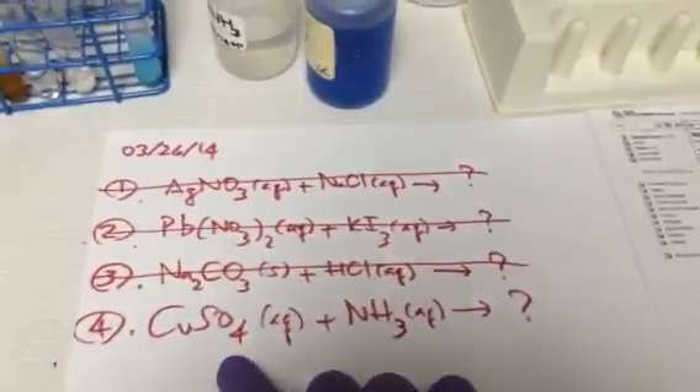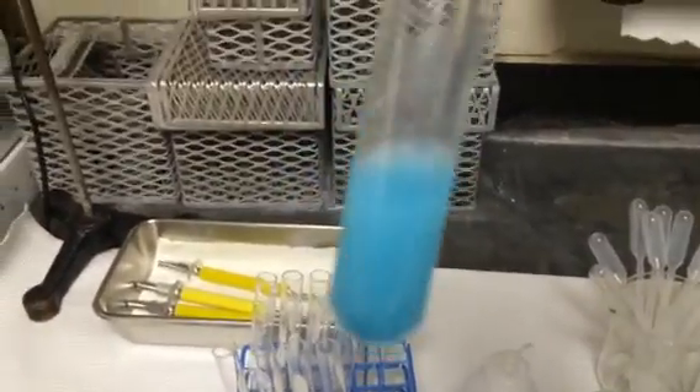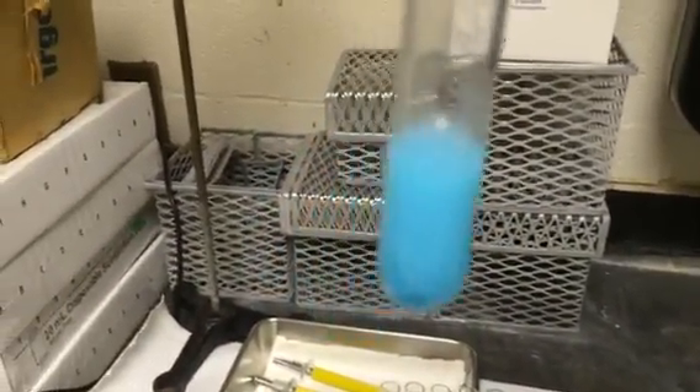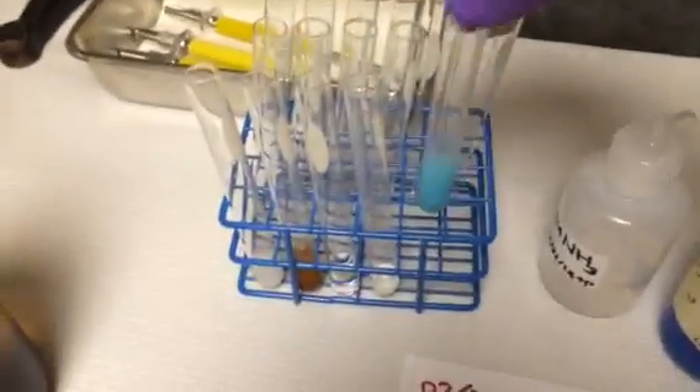Come to the last equation — I let it sit, let's see how it goes. It looks like we have some kind of blue and white precipitate here. And that's it for now.